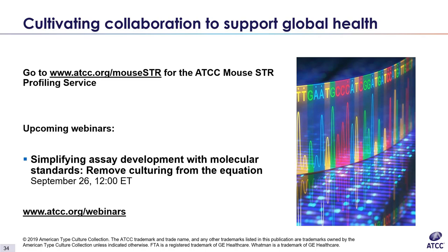So the computer software will scan the database to find any cell lines that match 80% or greater to your sample profile. To develop this database, ATCC has profiled our cell lines using the new MouseSTR assay to establish their baseline or reference profile. The profile database will continue to grow as STR profiles are updated and new profiles are added. And also, to answer another question that just came in, this database is not public.